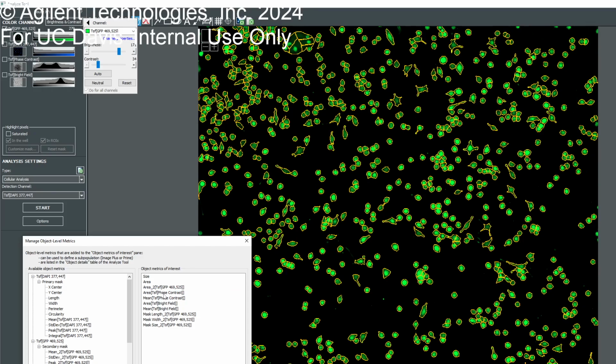Why are there two areas? There's phase contrast. Everything is phase and bright field, so you can. Yep. And the first area is for the nuclei, and the size is for the nuclei. Okay.